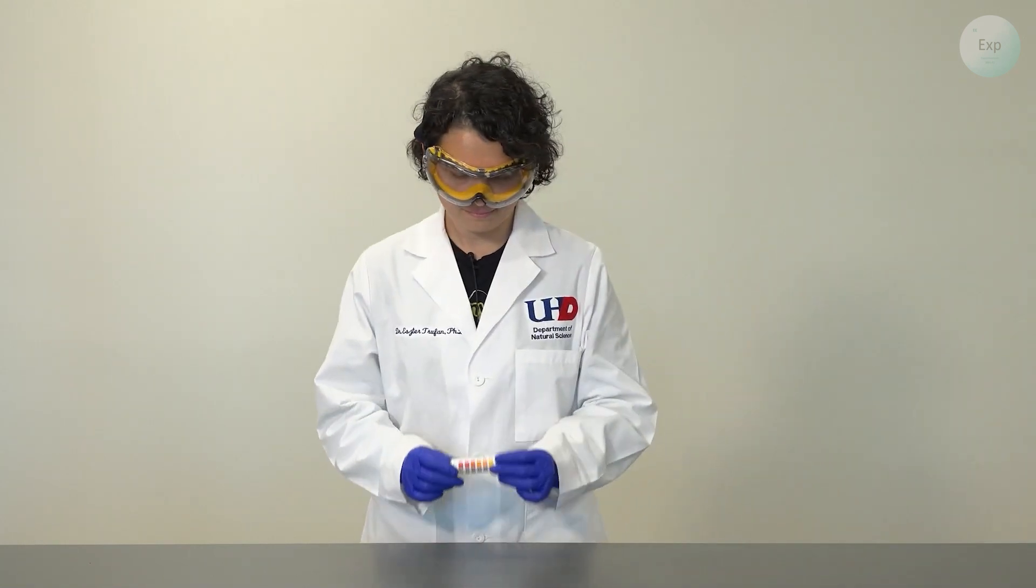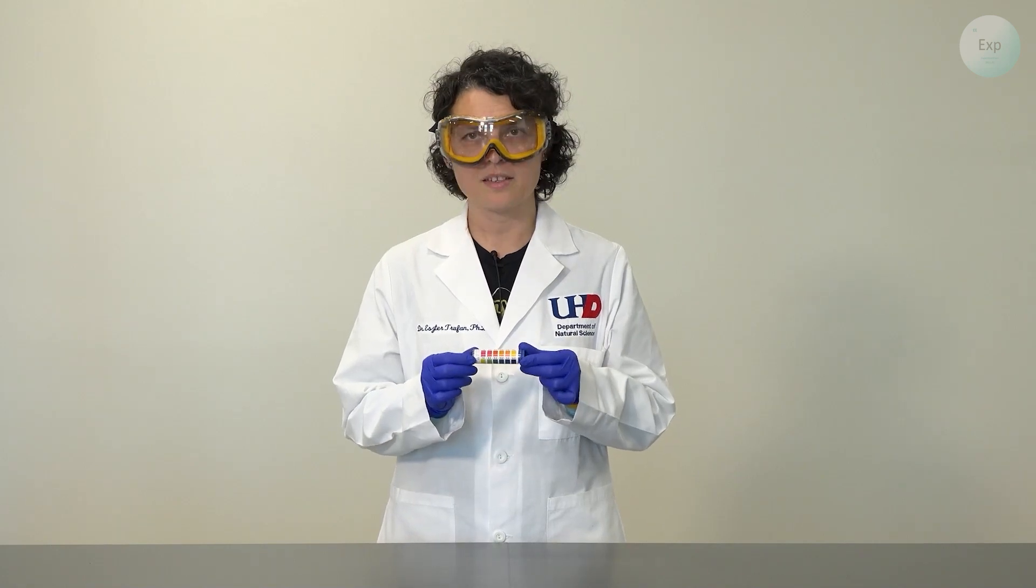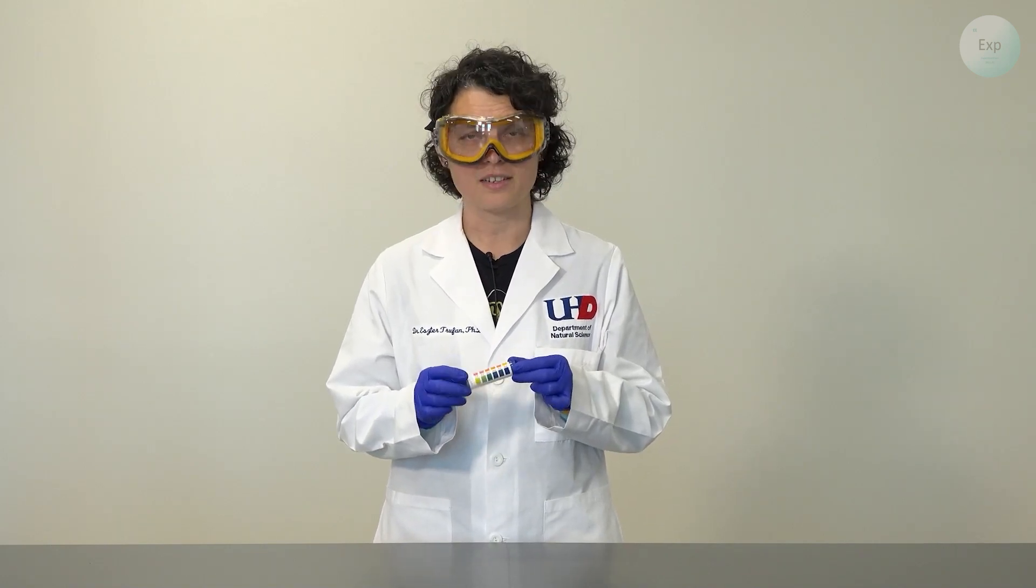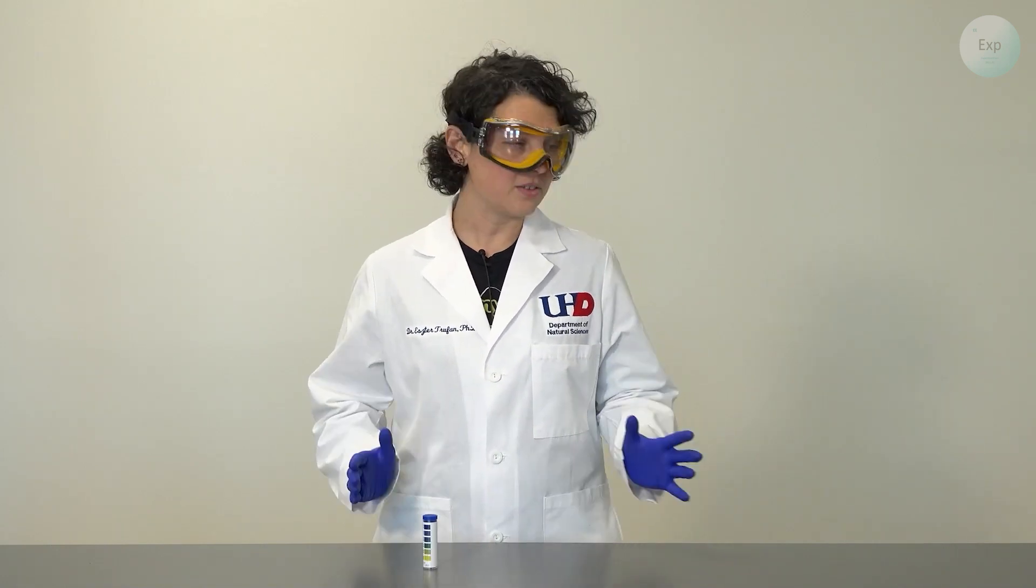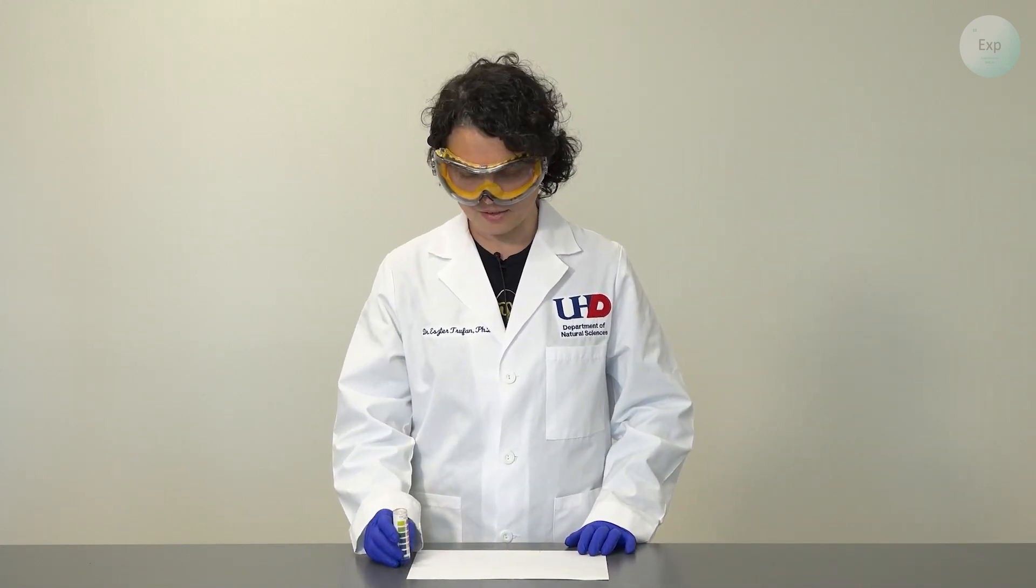For the experiment we're going to need pH paper and it usually comes in a small container with a scale that is printed on its side. We're also going to use a white piece of paper and this is just to help us more clearly identify the colors.